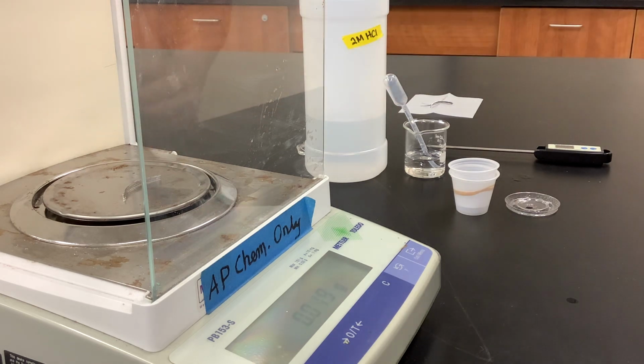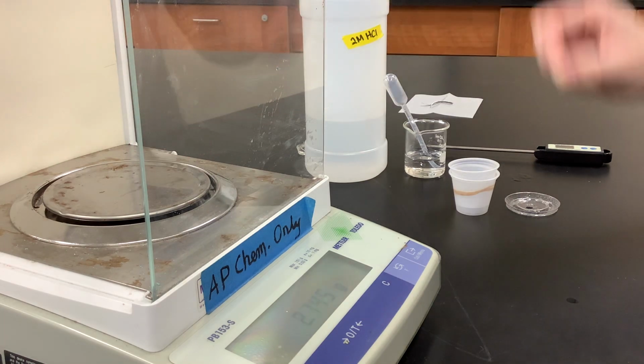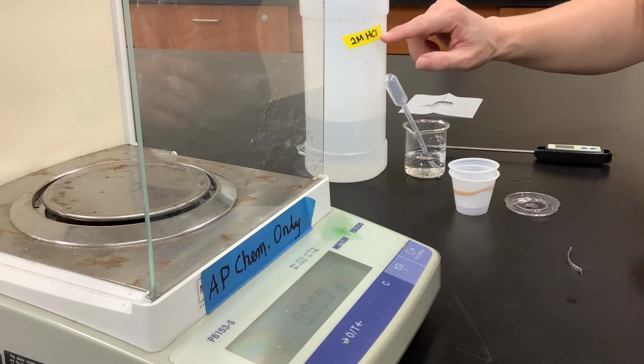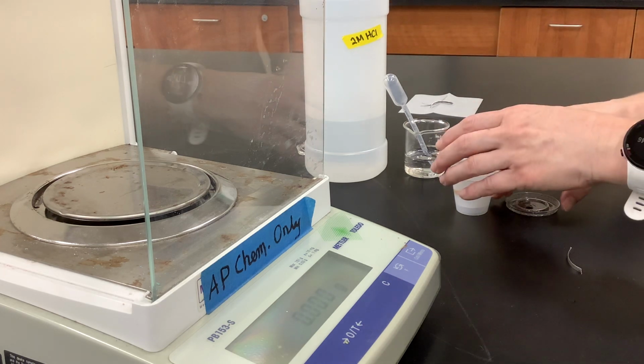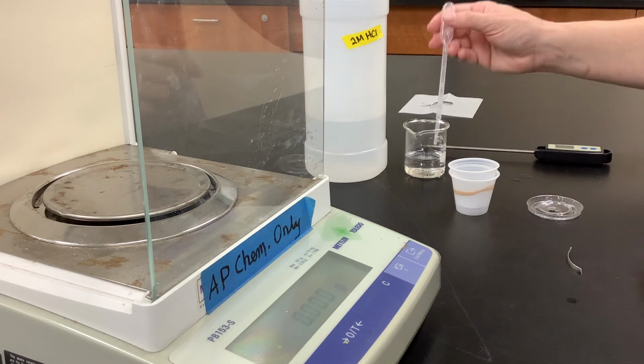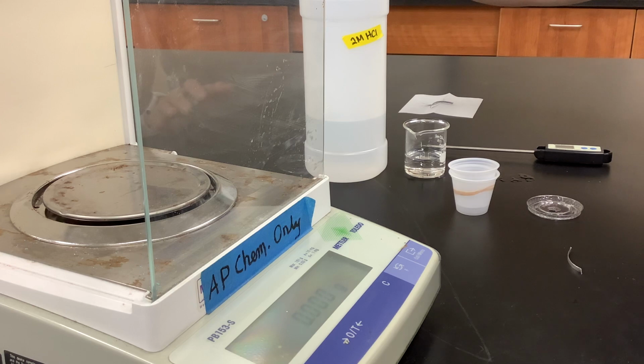We're going to place that on the scale and measure the mass, which looks like it's 0.065 grams. Okay, we have that. We're going to leave that here. We're then going to measure out approximately 10 milliliters of our hydrochloric acid. Once again, I'm going to use the droppers to get my approximate measurement.